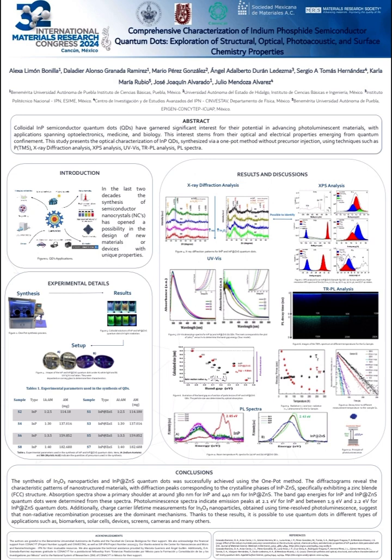And maybe you're wondering why the indium oxide is in there, and I'm going to tell you why. As we go down in our samples, the myristic acid increases, and the indium oxide does too. This is because the interaction of the myristic acid and the indium acetate produces oxygen and, as a result, indium oxide nanocrystals.